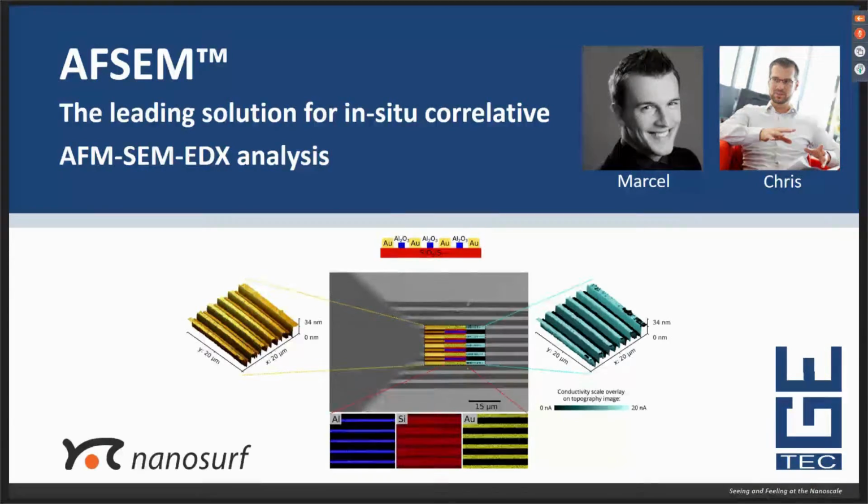After that, Marcel will show you step by step how to perform a true correlative experiment with the AFSEM. Then we will present to you the latest application measurements and close with answering your questions that will come up during the webinar. So I encourage you to use the chat window on your screen and post your questions, and we'll then try to answer them at the end of the webinar.